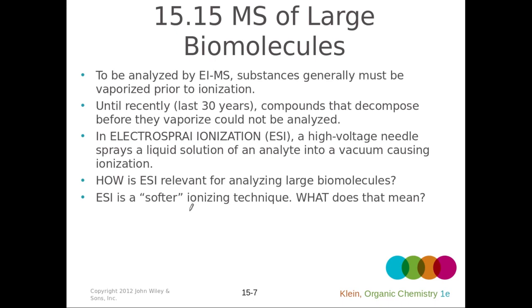Now we have new, more gentle ionization techniques that allow these molecules to be ionized so that they can be carried toward the detector without breaking apart. One of these techniques is electrospray ionization.